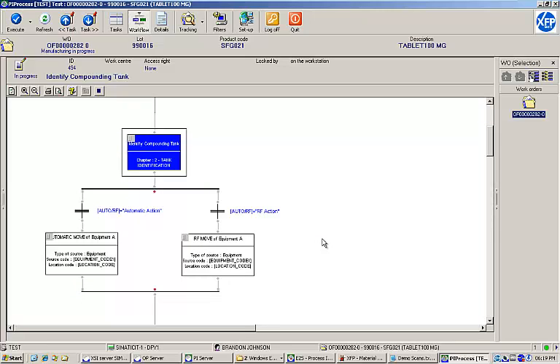If we look at the workflow view, we can see the next step has two possible paths. If we choose automatic action, execution will follow the left path. If we choose RF action, execution will follow the right path. Logic like this is easily built into the EBRs during design time. I'll reopen the tank identification task and choose automatic action.